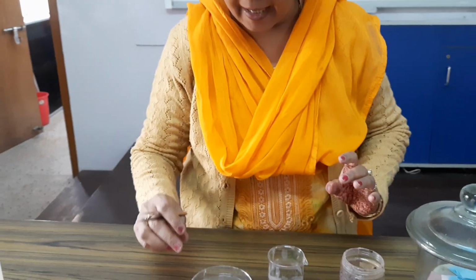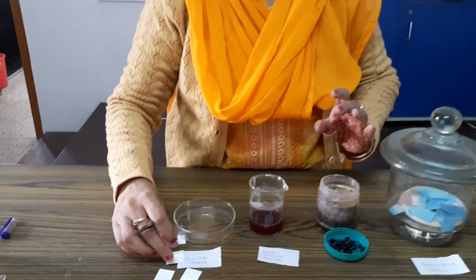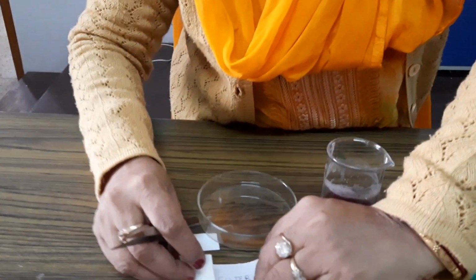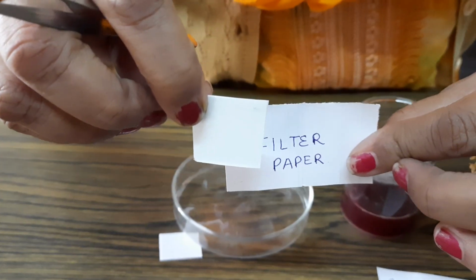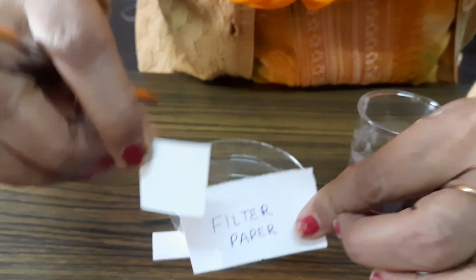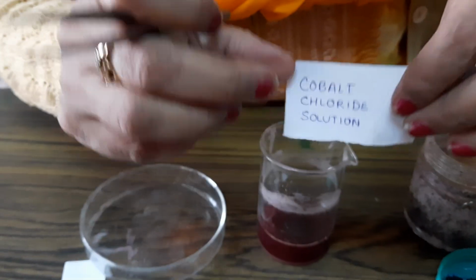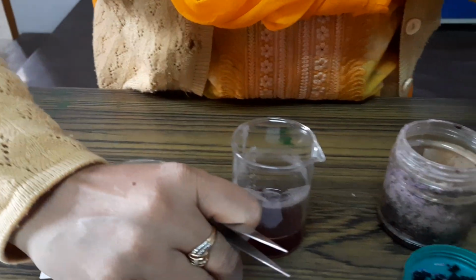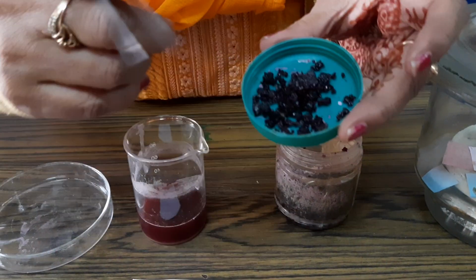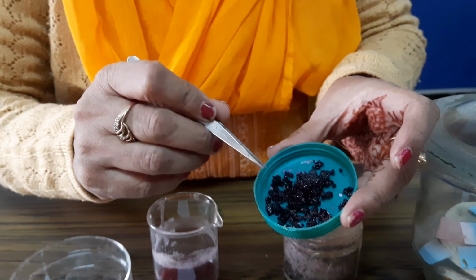Now for this, we have to start the experiment by taking a filter paper. You can see here, this is dry filter paper. I have cut it into pieces. You can see it is completely white in color. Now I will take a chemical here, which is called cobalt chloride. I will make a solution of this. You can see here, these are the crystals of cobalt chloride, which are purplish in color.